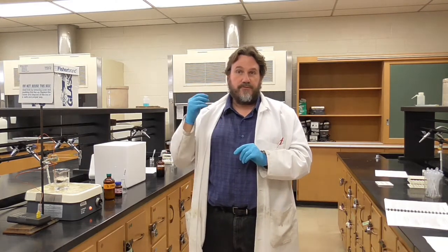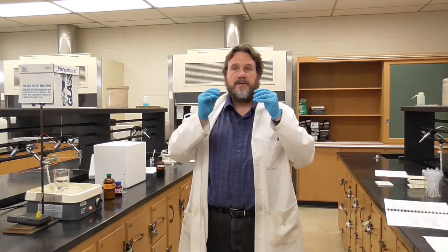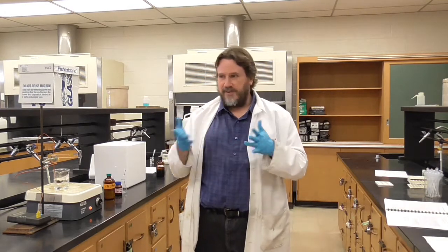The enzyme that catalyzes that breakdown is called amylase. Amylase is the enzyme, it's actually in your saliva, is the very first step of metabolism, actually. We're breaking down any large starches that you might eat. Enzymes work pretty well. When we have the enzyme present, starch gets broken down very quickly. If you don't have any enzyme present, that reaction is incredibly slow. In fact, so slow that in a couple hours here, we're not going to see any evidence of it at all. So it's kind of like an on-off switch. Either it's there and it's being broken down, or it's not there and we don't see it.